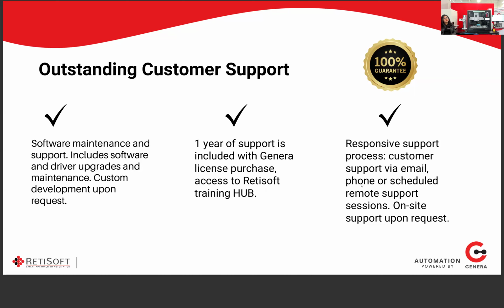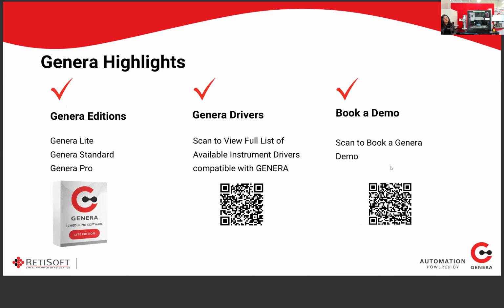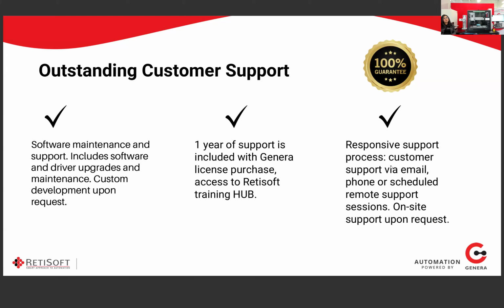And the most important thing, in my opinion, is the responsiveness of the support process. You could contact us via email, phone, or schedule a remote support session, and you won't be met by any AI at Retisoft. Every email that you send will be sent to a human being, and we'll get back to you as soon as we can.